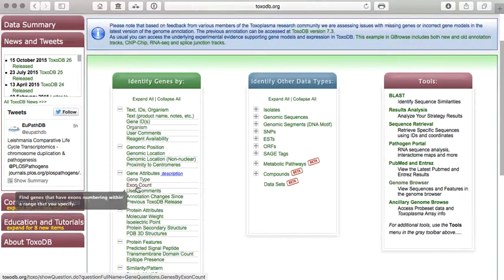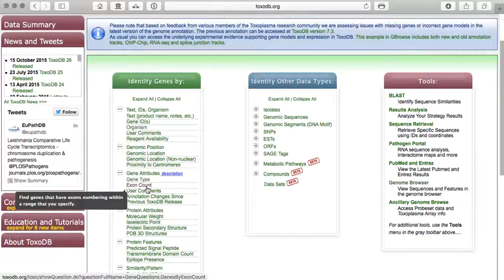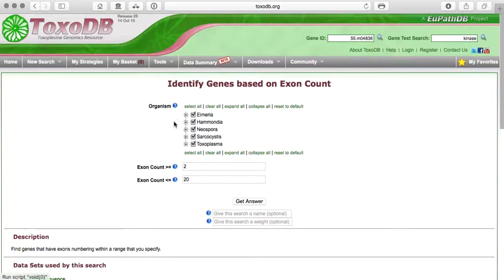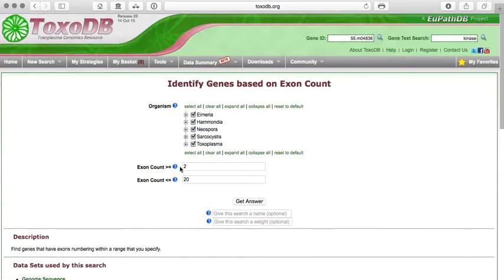So you can, for example, look for genes based on the number of exons they have. And if you click on this, you will see here that you have options. You can ask for which organisms you're interested in, and then define the number of exons you're interested in.